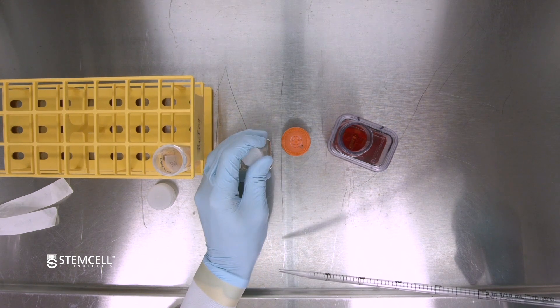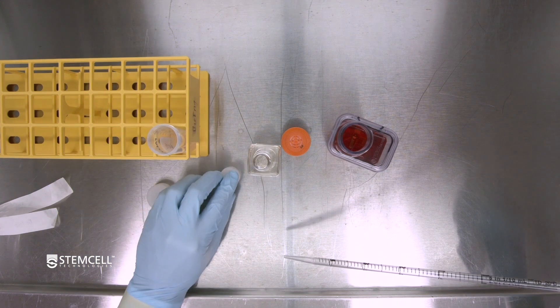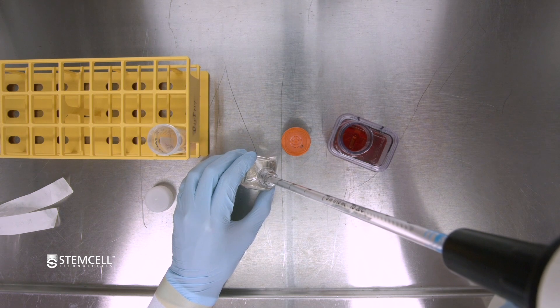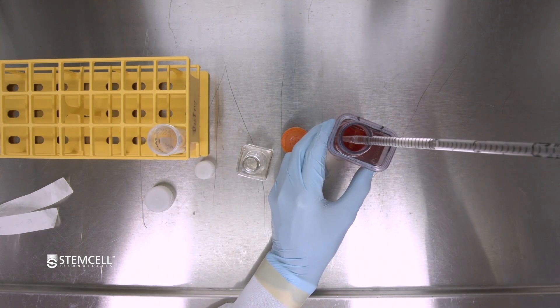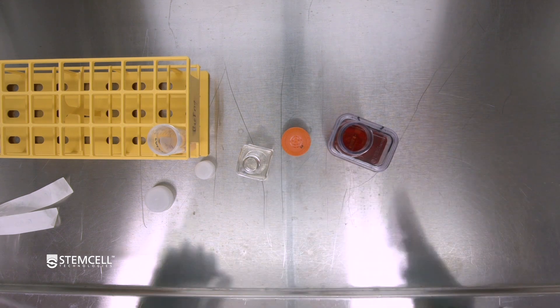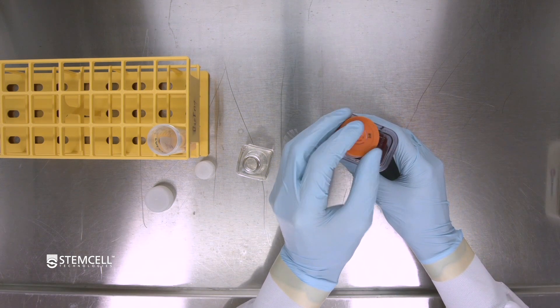Next, we will add the feed. Refer to StemCell's product manual for the feeding volumes. Using a 5ml or 10ml serological pipette, aspirate 3ml of feed volume and add it to the PBS 100 bioreactor. For our 100ml culture in TeSR AOF 3D, we are using a feed volume of 30 microliters per ml, so for 100ml of culture volume, we add 3ml.